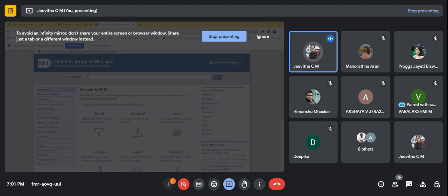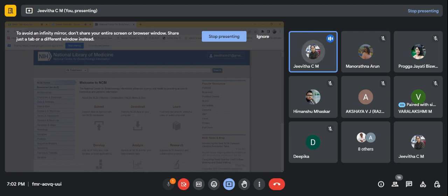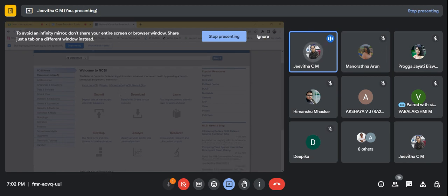The other thing is, you'll be going through some literature studies, and you'll have some accession number of the gene, and when you have to look into it, you have to come to this NCBI data. So handling NCBI is the basic bioinformatics exposure everyone should have, because this plays a major role in data analysis, in getting the data, everything.